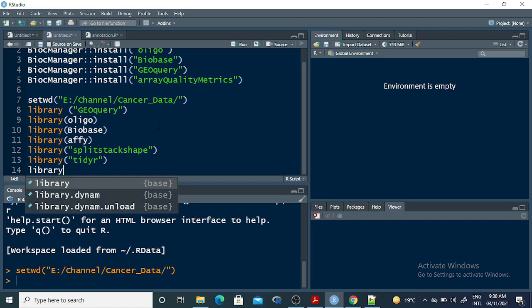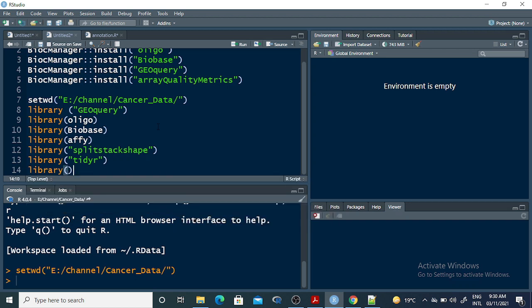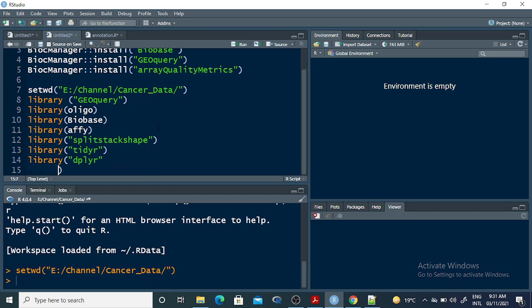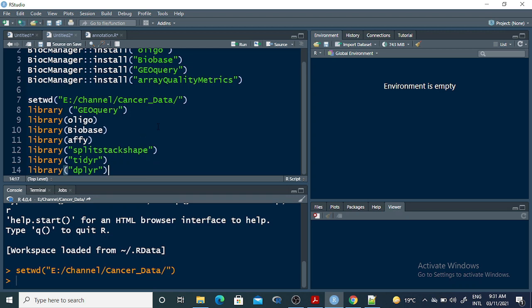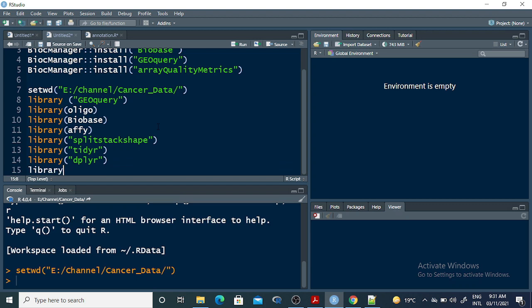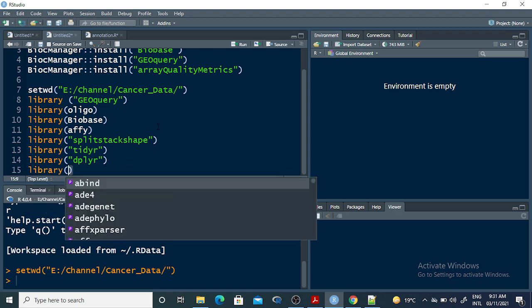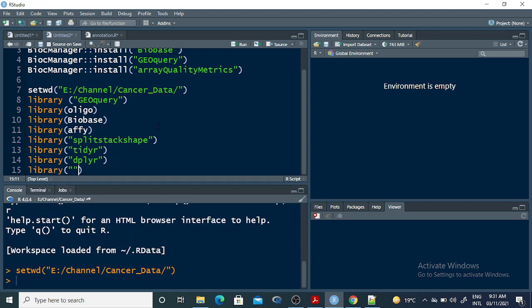If the dplyr package is not installed, you can install it using the Bioconductor manager install command and just write 'dplyr'. Lastly, if you want to check the quality of the data, you can use the arrayQualityMetrics package. These are the libraries you will need for the analysis.